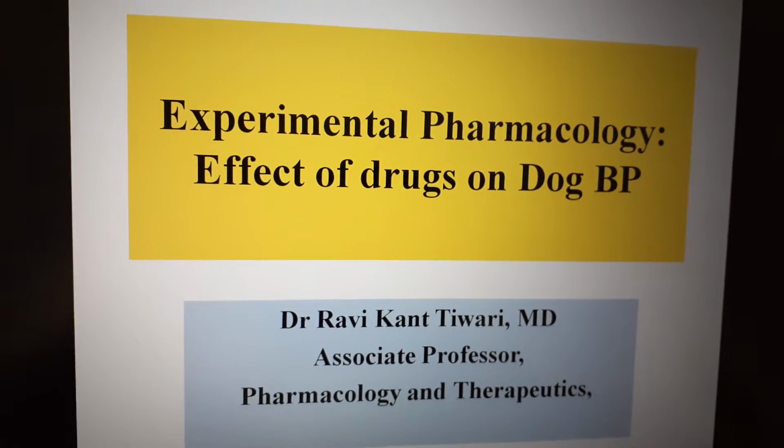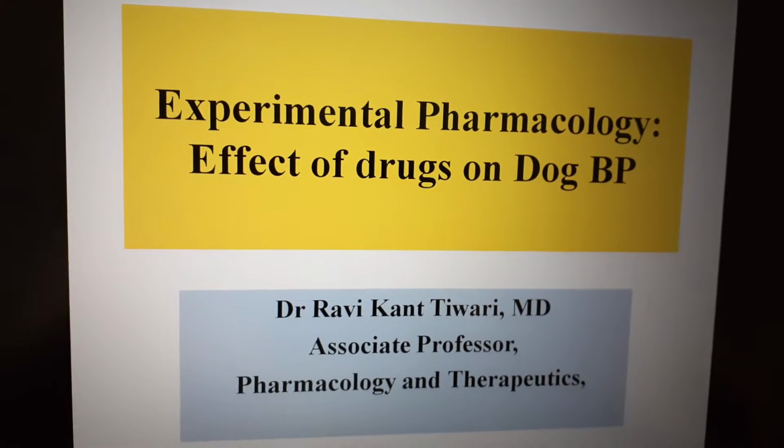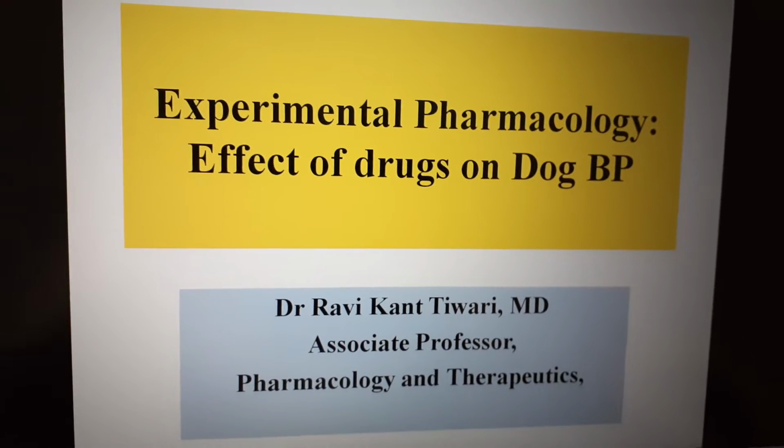This is Dr. Ravi Kant Tiwari from the Department of Pharmacology, and today I am going to discuss with you a special topic, that is effect of drugs on dog blood pressure.